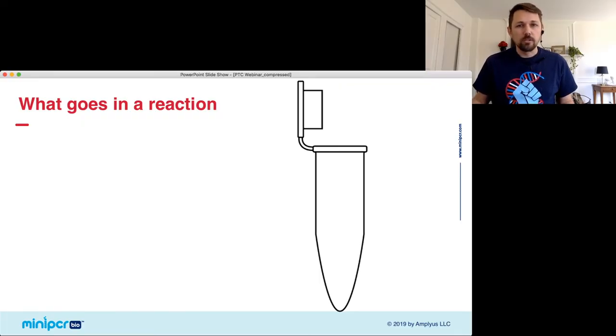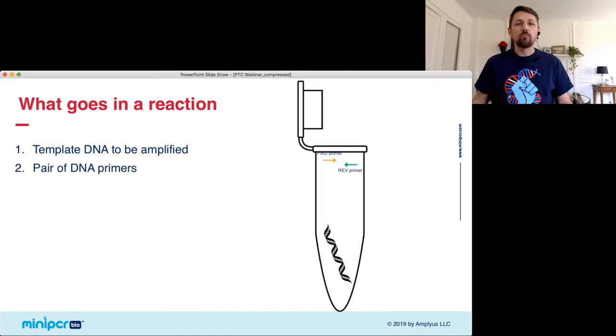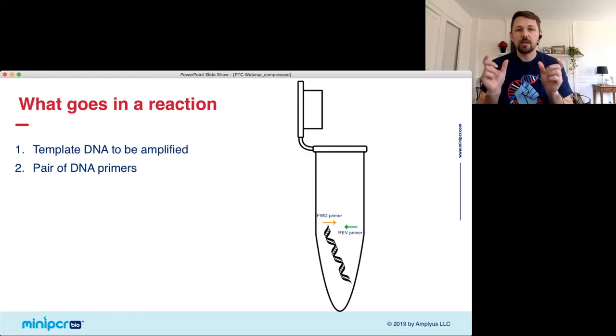we take one of those little tubes that we had before, and in it we put the DNA to be amplified. That's the DNA that I took out of my mouth and is boiling right now. We need primers. So primers are really special sequences of DNA that you design for every experiment, and they come as part of the lab. They come as one of these little tubes here. I'll take it out in just one second. Those primers mark the beginning and the end of the gene that you're interested in. So the primers are what find the DNA that you want to make copies of.